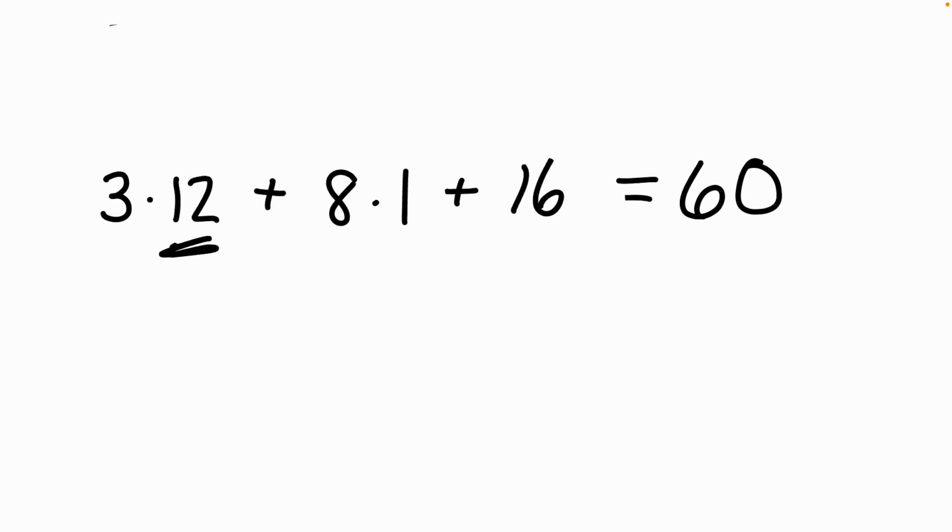Is that only carbon-12 atoms? That's an average of all the isotopes that exist. But this detector is measuring single atoms that are hitting it. So it can tell the difference between a carbon-12 atom hitting it and a carbon-13 atom. It's not like this is on bulk anymore. We are separating out and looking at individual molecules.